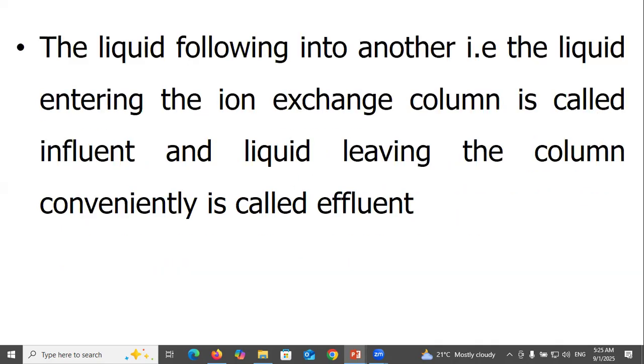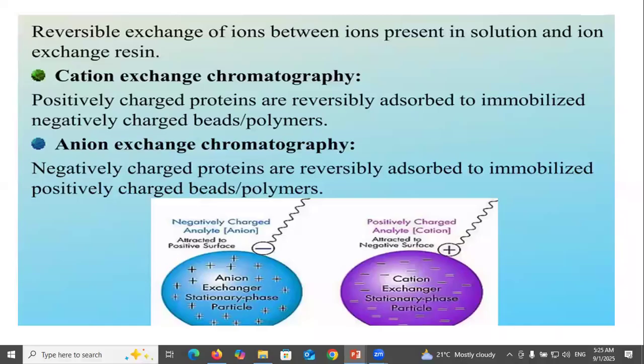The liquid entering the ion exchange column is called influent, and liquid leaving the column is called effluent. Influent and effluent: the liquid entering the ion exchange column is called influent, and liquid leaving the column conveniently is called effluent.